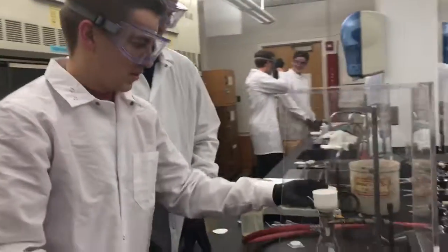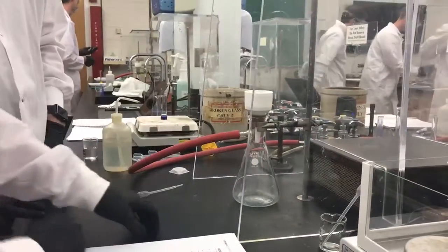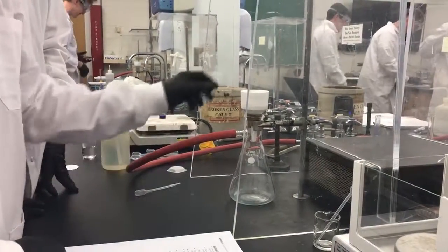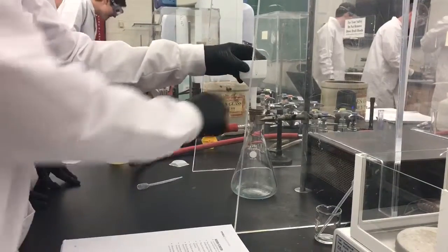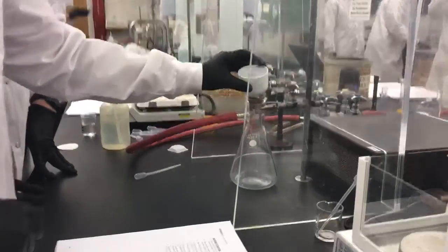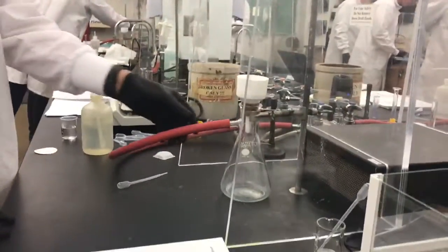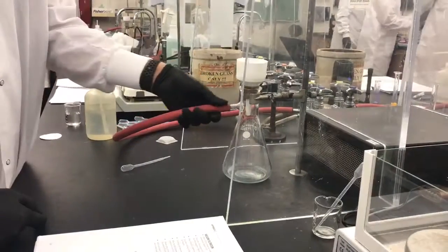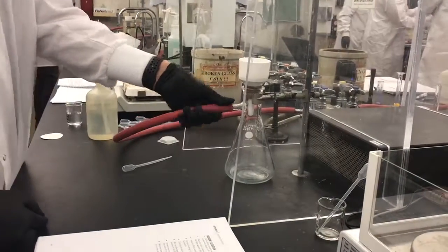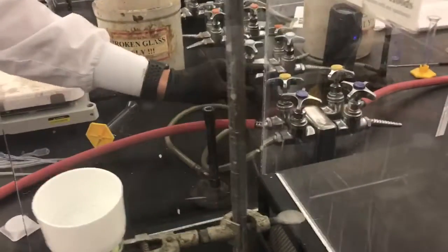What we've done with this vacuum filtration is we've stabilized the flask by using the clamp and made sure it's on the counter. We've put the adapter into the flask and then a funnel, and we've already put a piece of filter paper and wetted it. We take the tubing and connect it to the sidearm of the flask and then to the vacuum system, which is over here on the lab bench — the one labeled LV for lab vacuum.